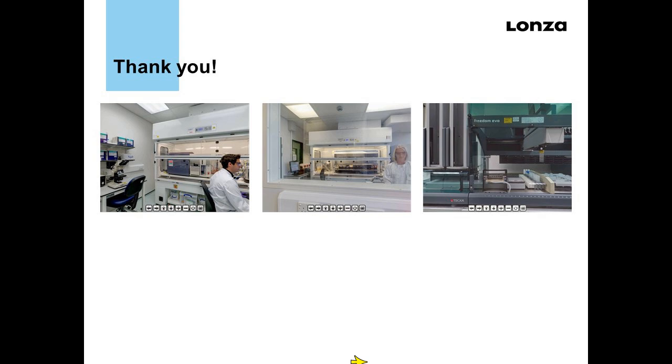And are there any limitations of using the NIBRT library, and how confident are you on the proposed structures? So the NIBRT library, the 2AB library, is a very good library, and there are over 300 structures that we can screen against. However, what we've found for mammalian cells is that when you start to get to the more complex profiles with triantennary and tetraantennary, those structures aren't in the current NIBRT library that's available. And so for that, we've actually had to do our own work to provide information on the triantennary and tetraantennary structures.